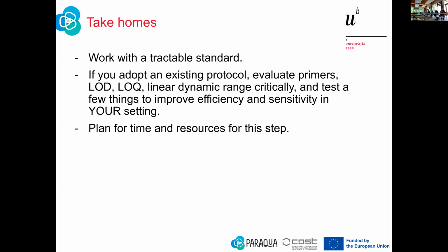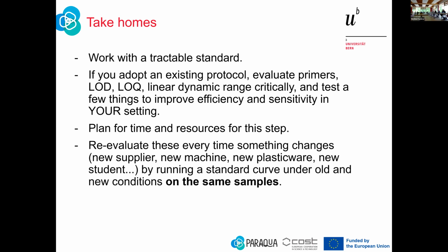I mean, if your supervisor tells you set this up, then we get the samples in 2 weeks and you can test them, tell them no, give me 2 months. And yeah, again, if you order a new supplier, a new reagent, you have to, not if you reorder primer from the same company, no. But if there's something, for example, if a new person in the same lab starts the assay of somebody else, reevaluate this. In your hands, it might be a bit different.